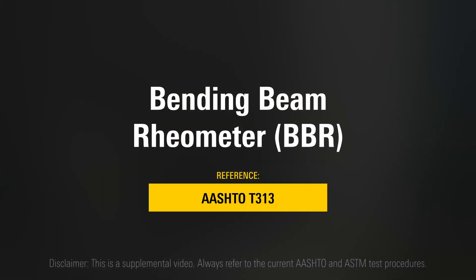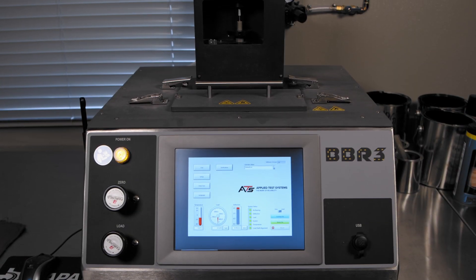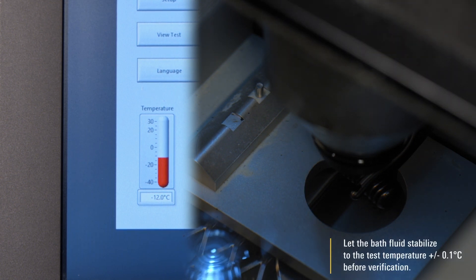AASHTO T313 Bending Beam Rheometer. Inspect and clean supports and bath interior for debris daily before testing. Adjust the bath fluid to the required temperature for testing. Let the bath fluid stabilize to the test temperature plus or minus 0.1 degrees Celsius before verification.